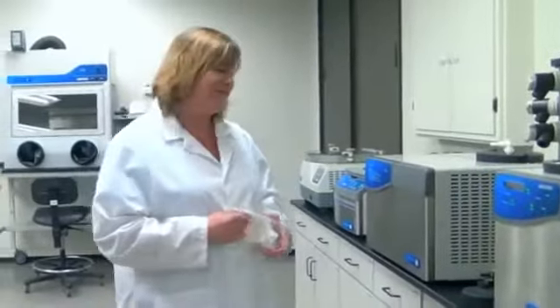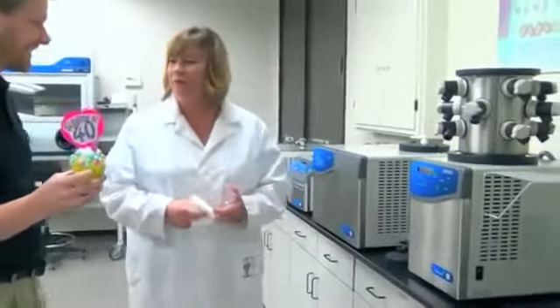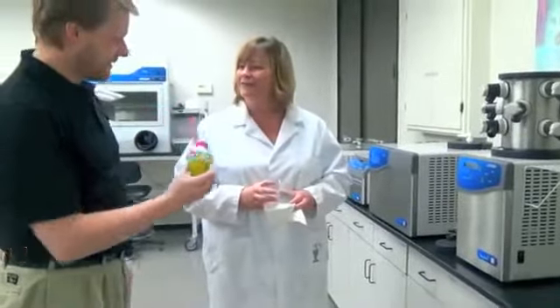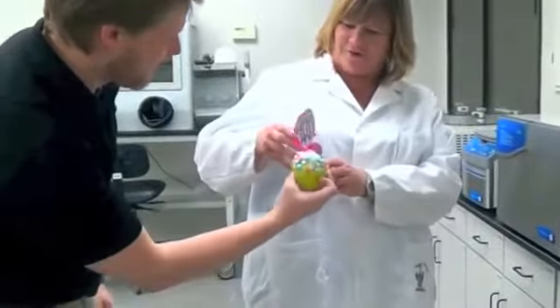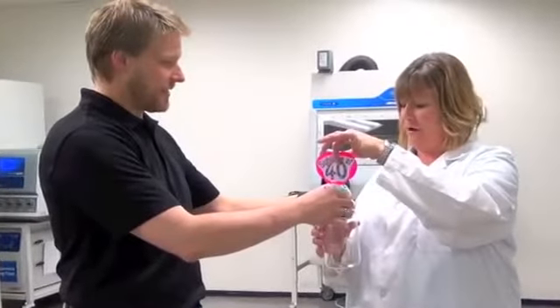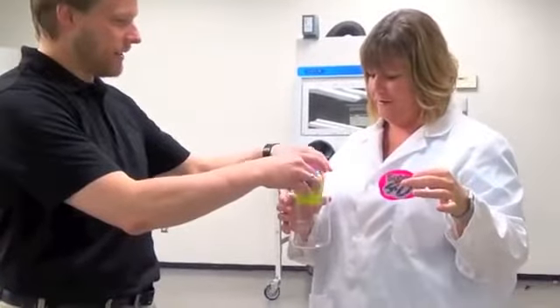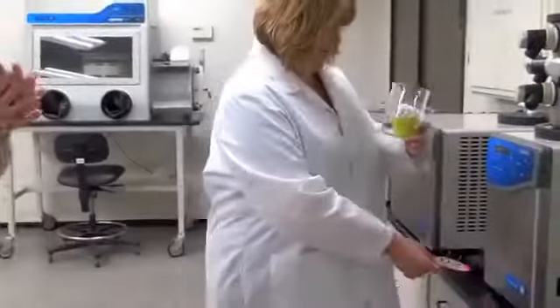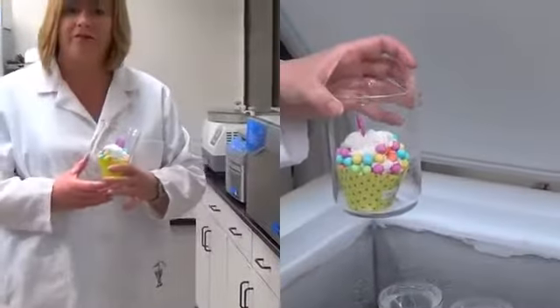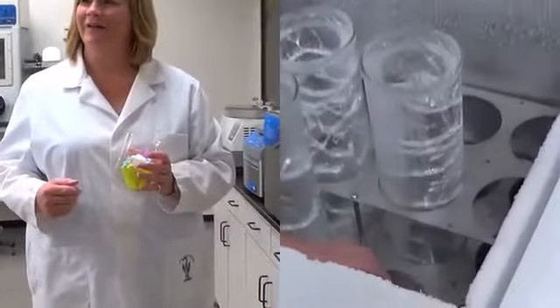You're kind of my freeze-dry expert, I don't know how to do it, so yeah, show me what to do. First step, if we're going to freeze-dry this cupcake, would be to get an appropriate flask and to pre-freeze it. It looks like this might work. You're going to have to take the topper off — it won't freeze-dry much anyway. We have a freezer we'll go ahead and freeze this in. It will take a couple hours.